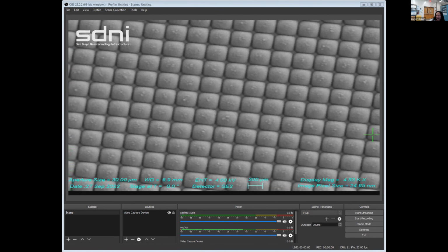The digital pictures that we see consist of millions of these pixels in different colors and different color intensities, which make up what we see on a screen.